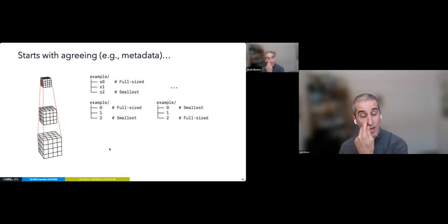And for what it's worth, it all begins with some quite simple agreements. So there's not magic going on here. What allows people to zoom into an image like the zebrafish is having pre-computed resolutions of the image. So basically downsample your image, store them all together as a multi-scale pyramid, and then you can get Google Maps style storage.